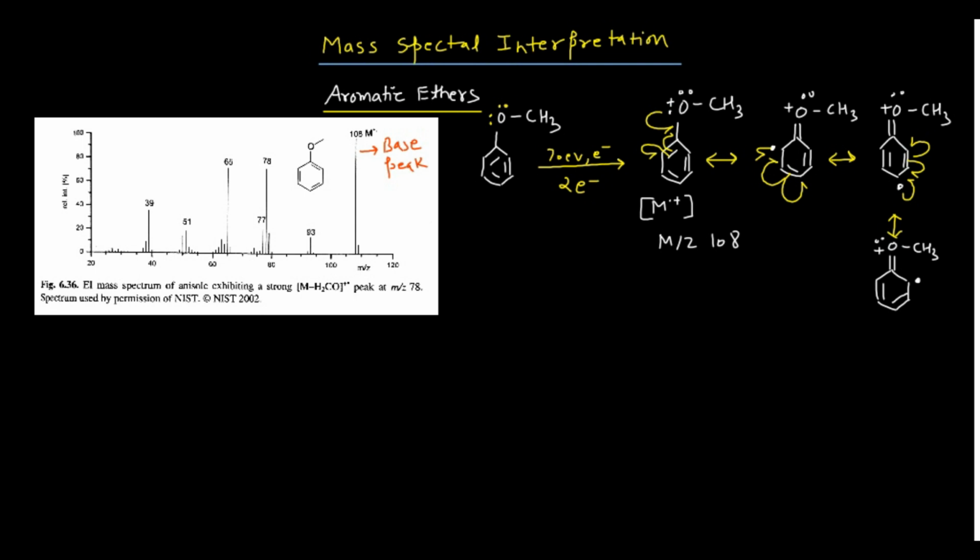So how can we do it? See, again, this will move here, this will come down, and this will go up. And when this happens, you will get your final structure, and that structure is the resonance stabilized structure of your molecular ion, right? This, and this. This is your single bond now. This is OCH3, a lone pair over there, and a positive charge. So you can see here, what is the difference between this particular structure and this particular structure? Only the presence of the double bond.